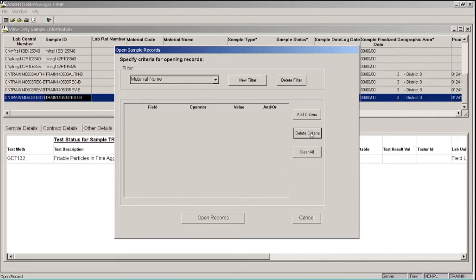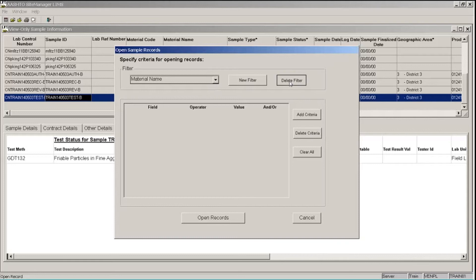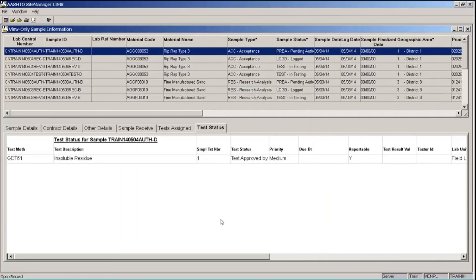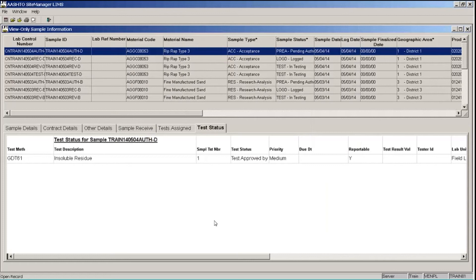I also want to delete the filter that I created, the Material Name Filter. So I make sure that that is what is showing in my dropdown list, and I click the Delete Filter button. And then I want to go back and click the Open Records button, which will remove that filter that we had saved, and brings me back to the Generic Filter list of information.